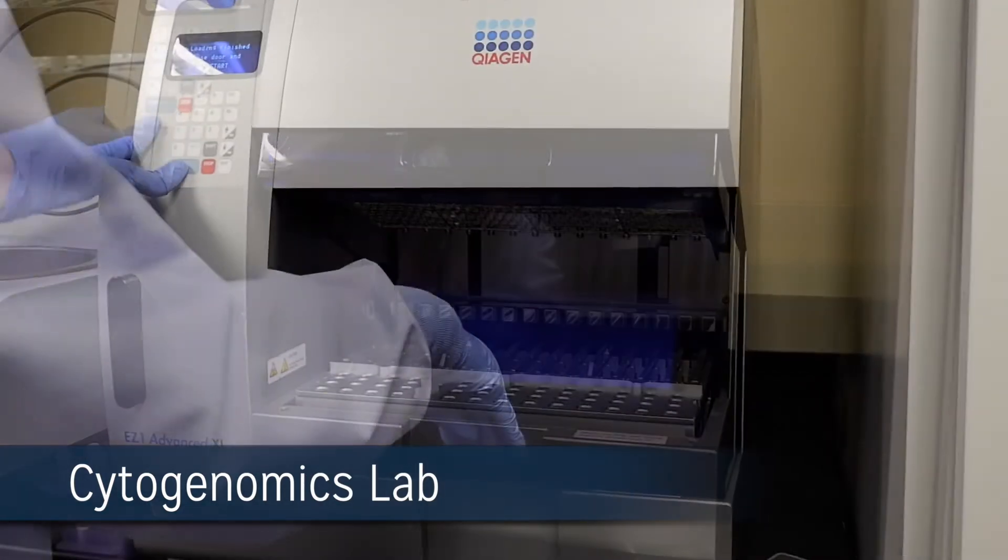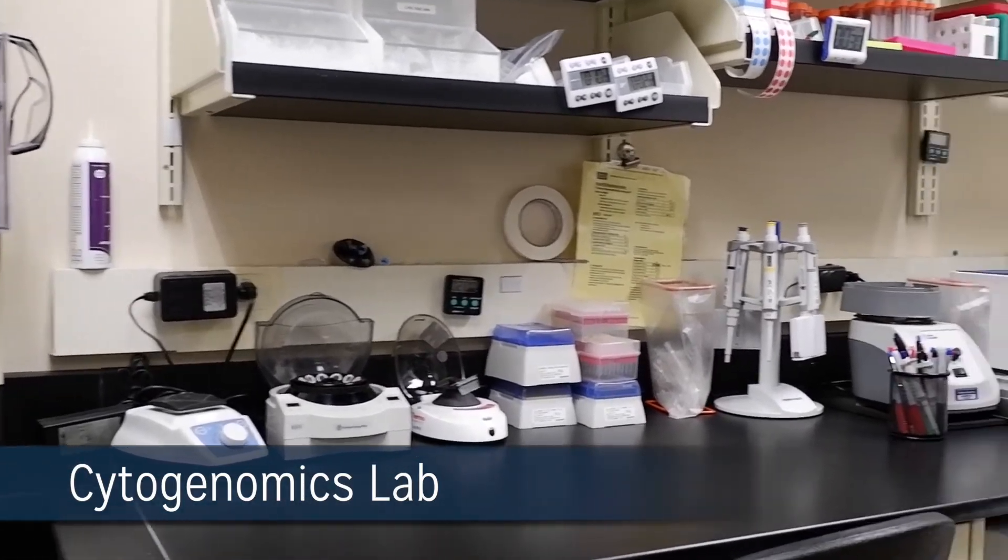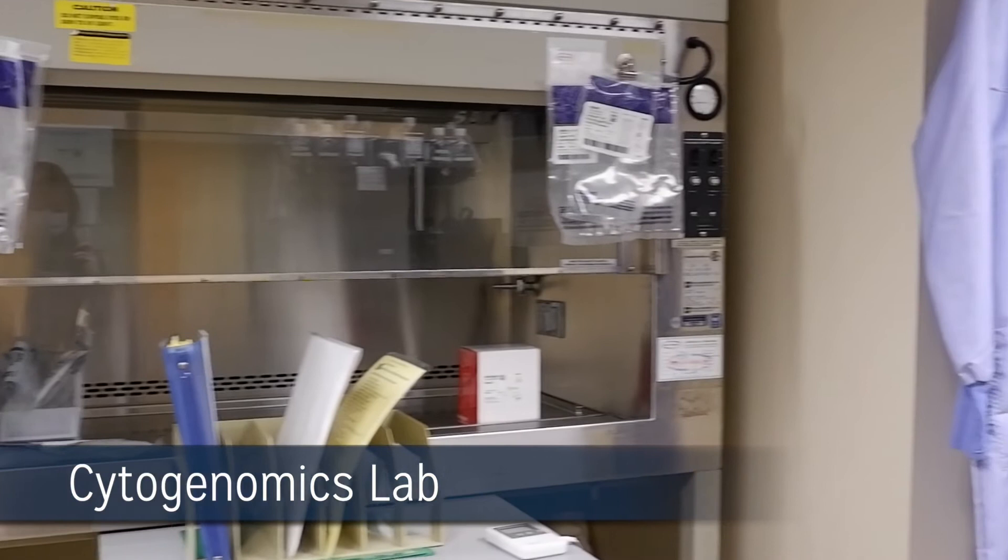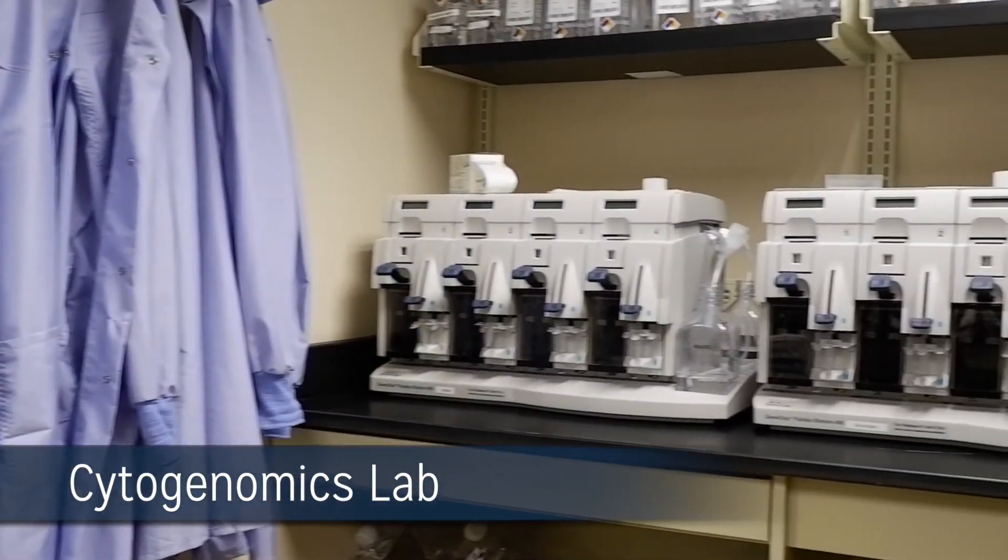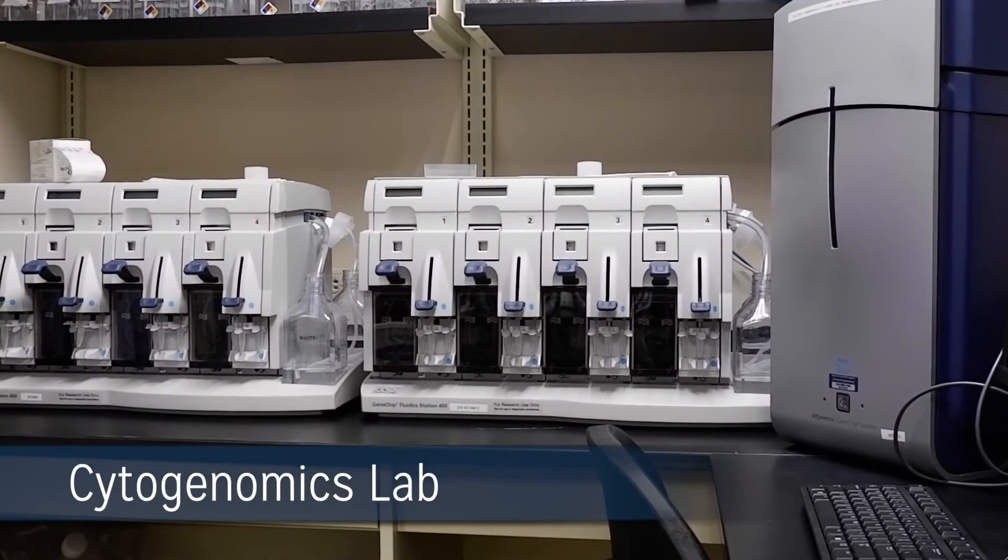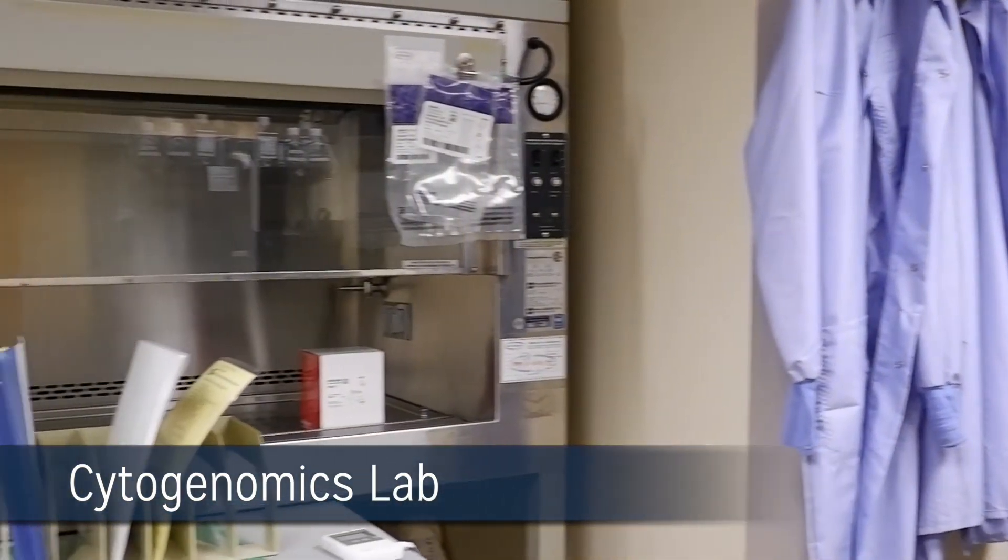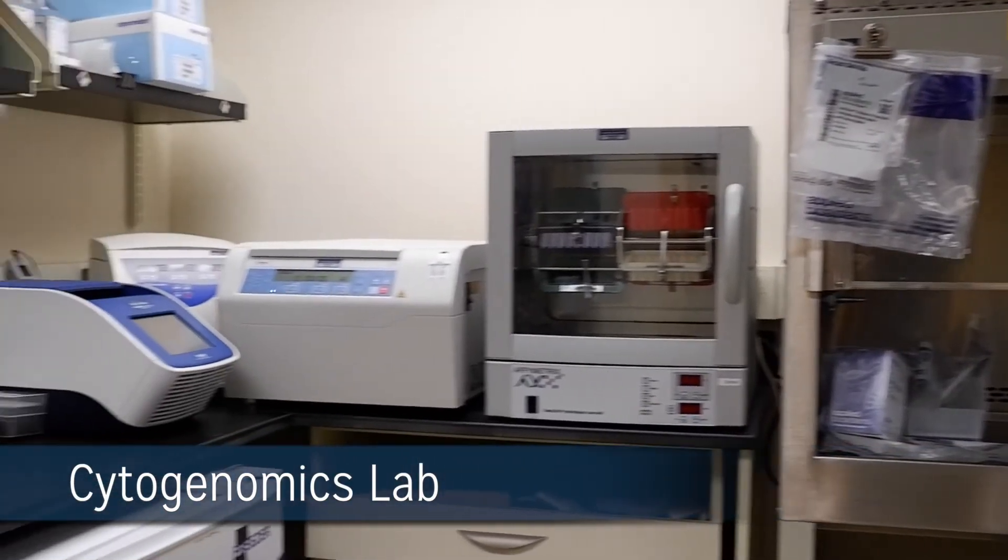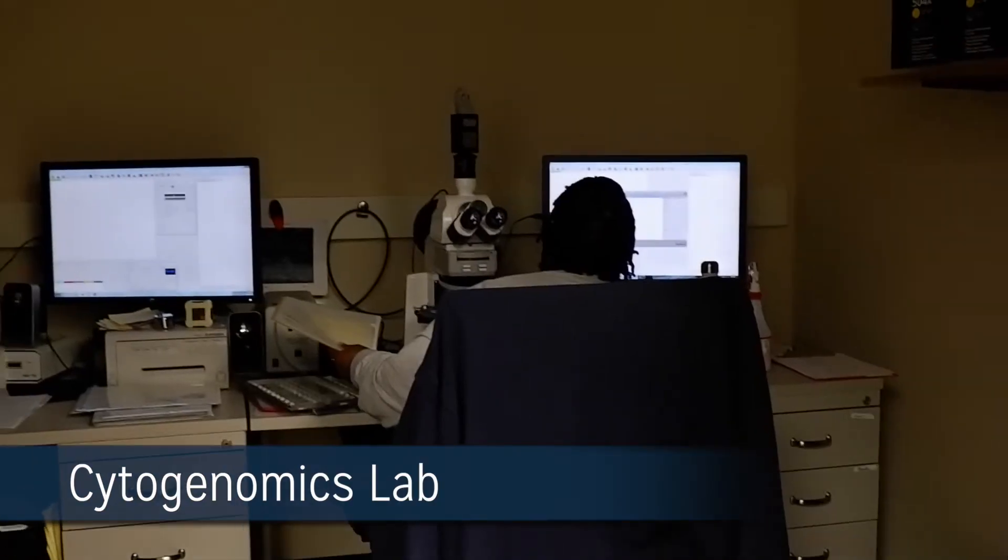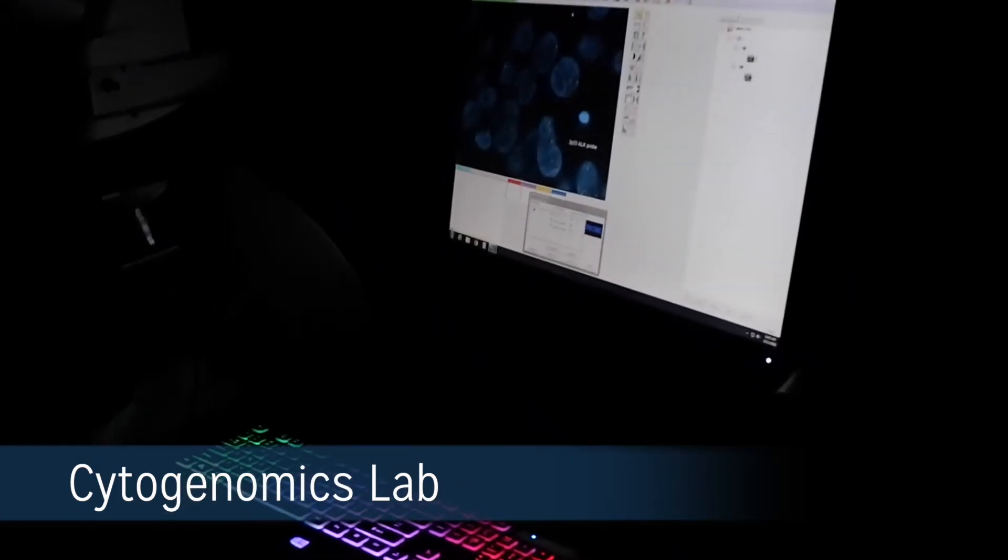Automated DNA extraction equipment reduces hands-on time and produces exceptional quality DNA using a magnetic bead system that can process up to 14 samples in approximately 20 minutes. Chromosomal microarray analysis performed at the cytogenomics laboratory has the capability to process fresh samples from patients with congenital anomalies, pregnancy losses, hematologic disorders, and tumors. Formalin-fixed paraffin-embedded samples can also be tested for multiple specimen types, such as products of conception and tumors. The Affymetric Cytoscan HD and Oncoscan FFPE assays are extremely high resolution and can provide information about the copy number state of chromosomal regions and also detects absence of heterozygosity.